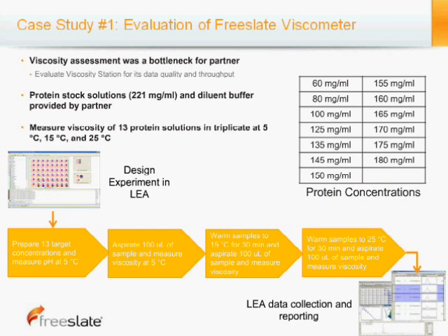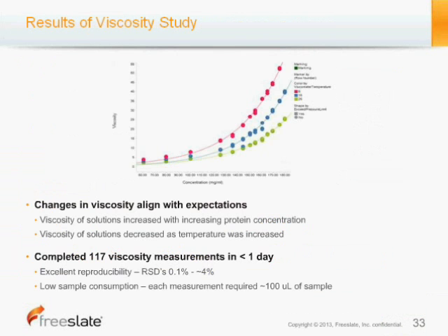The results of the viscosity studies were this. In the graph, you can see that the changes in viscosity align with expectations, which is what we expected. The solution viscosity increased with increasing protein concentration, and the solution viscosity decreased as the temperature was increased.